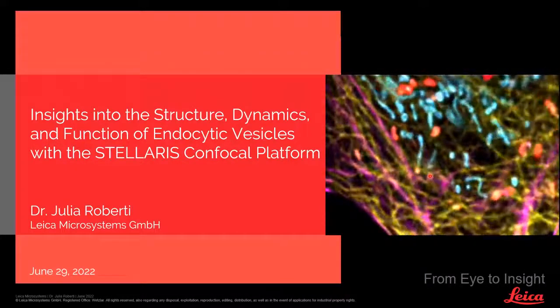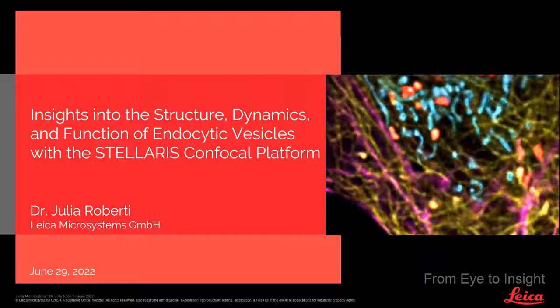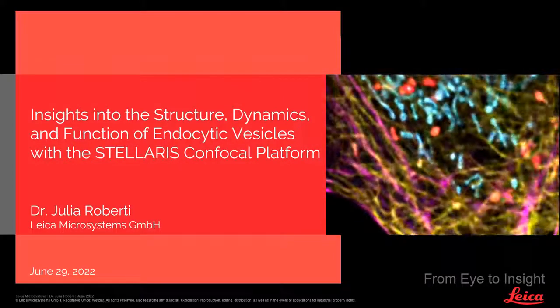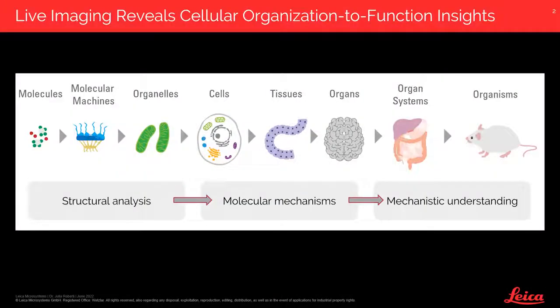the endocytic pathway. We know that these vesicles are not just swimming inside the cells, but they shuttle material by interacting with multiple organelles and cellular components, and they do it in a very dynamic way. This dynamic aspect, of course, is a common theme of life, and using different light fluorescence imaging approaches, we can find answers from a structure going to molecular mechanisms to reach a mechanistic understanding and a functional understanding of a given process, going from molecules to organelles to organisms.